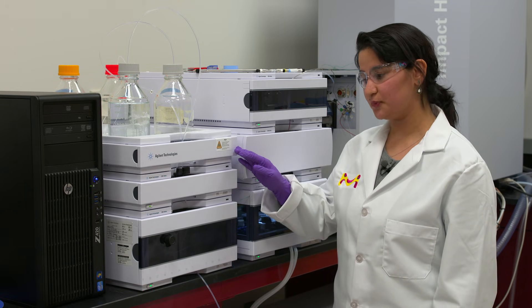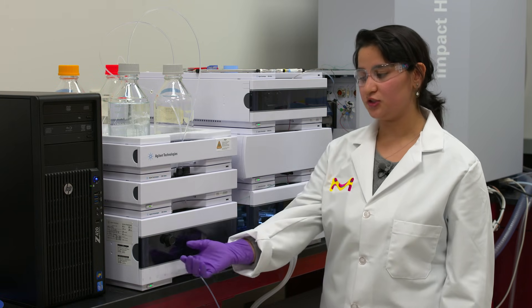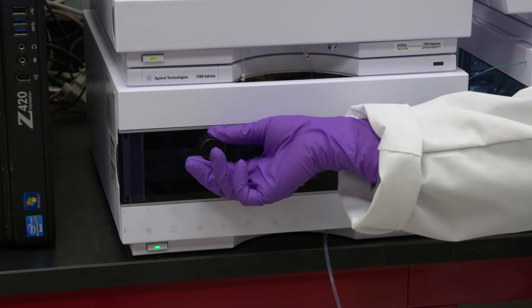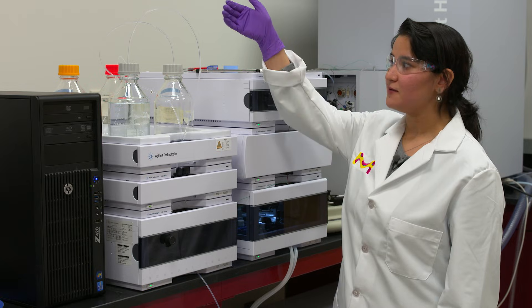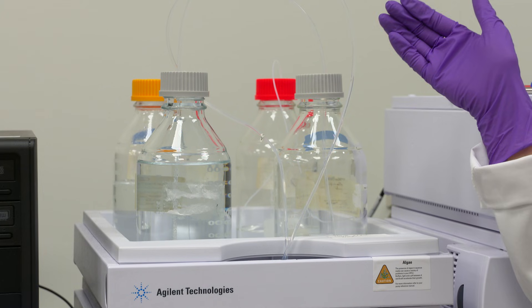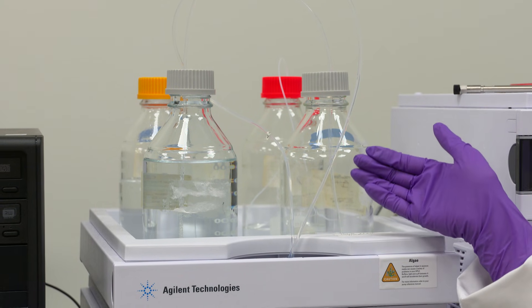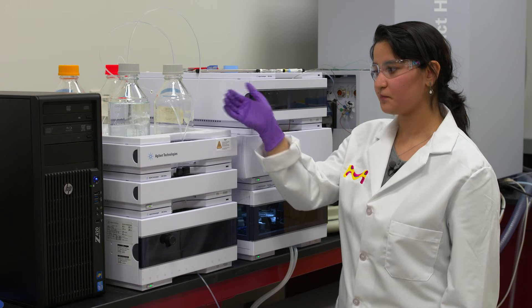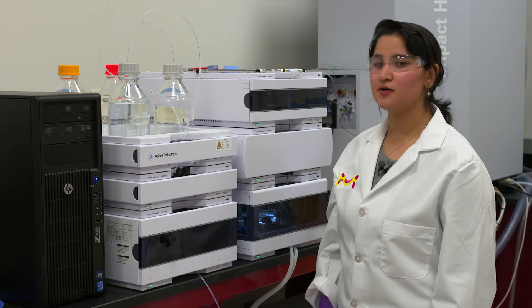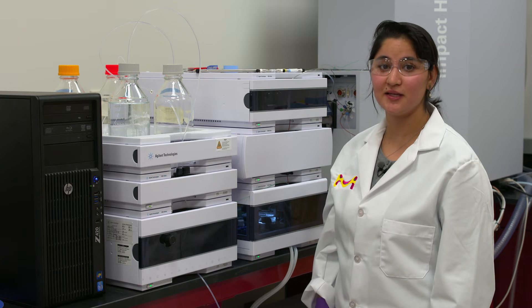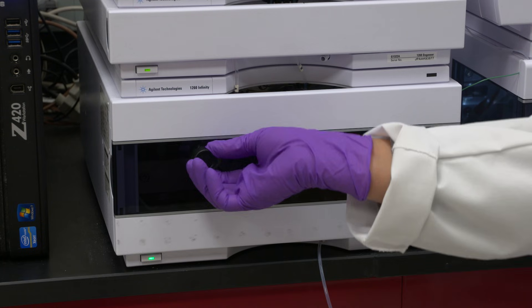To purge your HPLC, you will use the purge valve by opening it, which will be turning it to the left. Now you'll see that the tubing will eliminate any bubbles that could be in the mobile phase tubing. Once there are no bubbles flowing to the mobile phase tubing, your purge process has been completed and you can close your purge valve now.